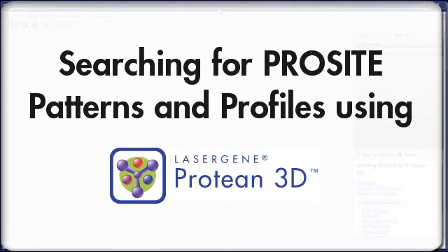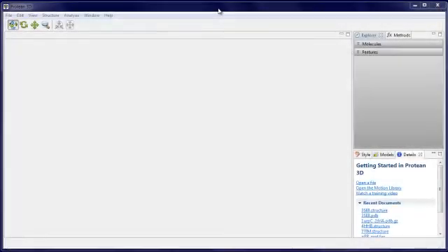In this video, I'm going to show you how to find patterns and profiles from the PROSITE database in your protein structure or sequence data using Protean 3D.